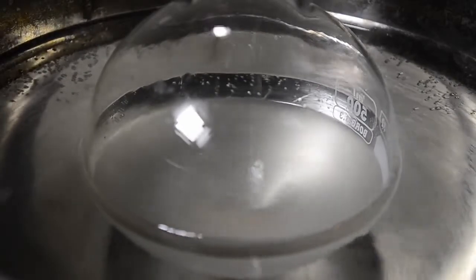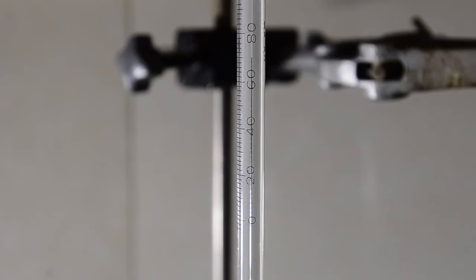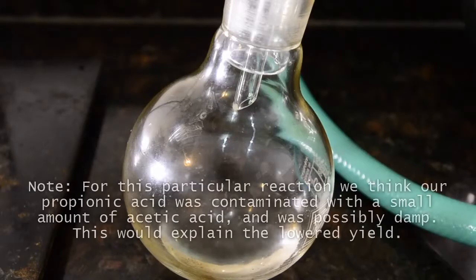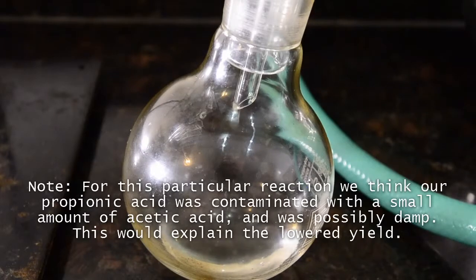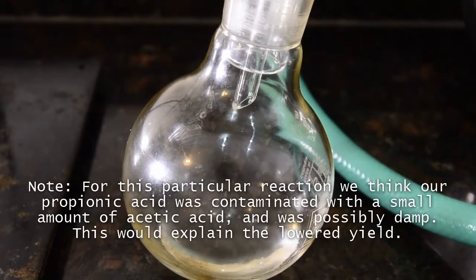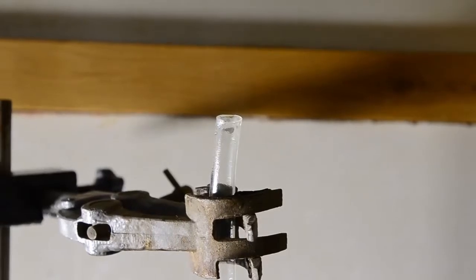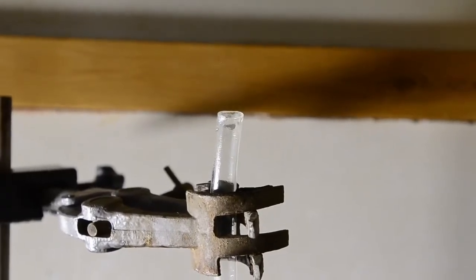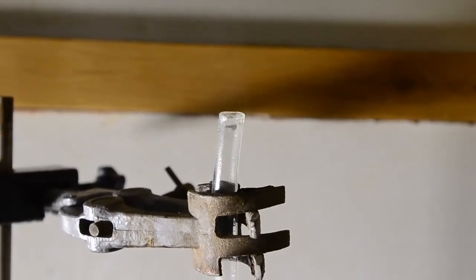Keep heating and the bulk of the distillate should come over above 70 degrees. Keep going until nothing more comes over. This took about an hour and a half in this particular case. HCl fumes continue to be produced to a lesser extent throughout the distillation.